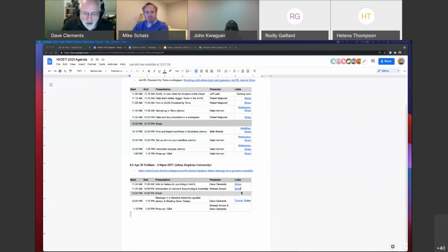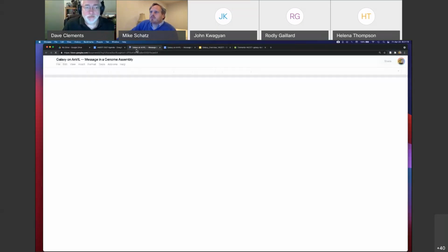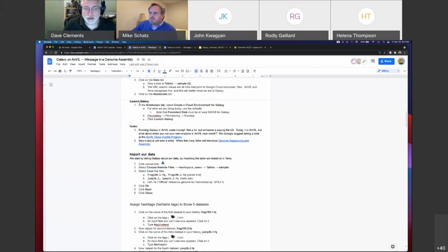So we're now going to do the tutorial and the slides. The slides are screen captures of what's in the tutorial. And so I'm going to be walking through the tutorial, which is right here. It looks like this. And the slides are there too, if you want to link back to those. But we're going to start right here: Explore Workspace and Launch Galaxy. We already did that, except now we're at the Launch Galaxy part.